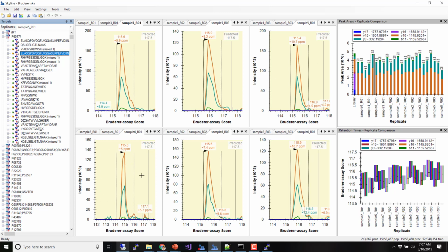So that's all that's really co-eluting here, and that's what I'm calling my peak. But at the very least, I'm really consistently picking the same peak, right? It doesn't look anything like what I'm expecting for my library, and I've got about P 0.44. So probably I don't really like that.